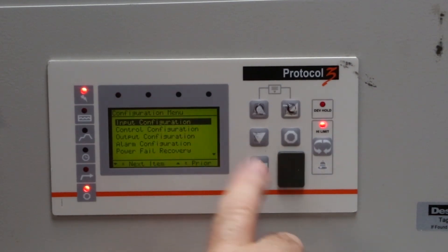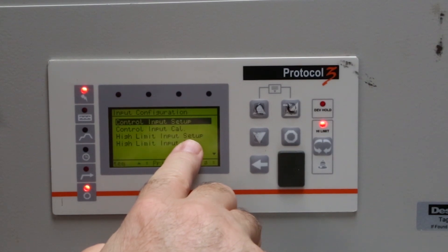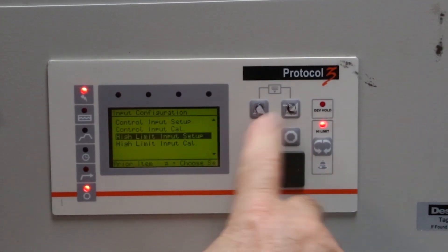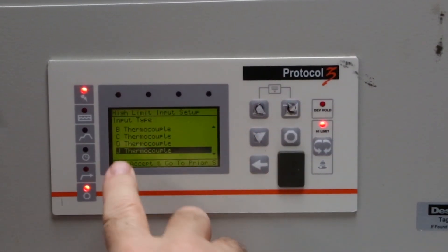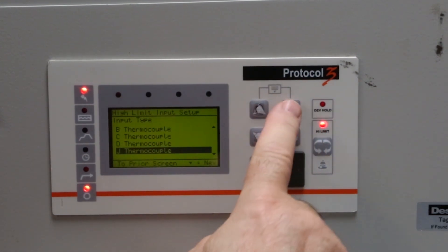Confirm input configuration is highlighted, and press enter. This time, highlight the high limit input setup, and press enter. Confirm that J thermocouple is highlighted, and press enter.